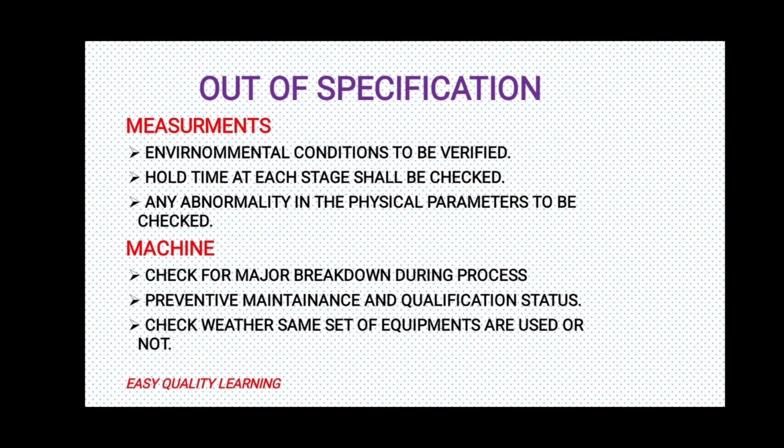Then measurements. We need to check the measurements. In measurements, environmental conditions are to be verified. Hold time at each stage shall be checked, whether there is any abnormal holding of the product at any particular stage. Any abnormality in the physical parameters needs to be checked. We need to see whether there are any physical changes in the granule characteristics or any physical changes in the core tablet. Then comes machine.